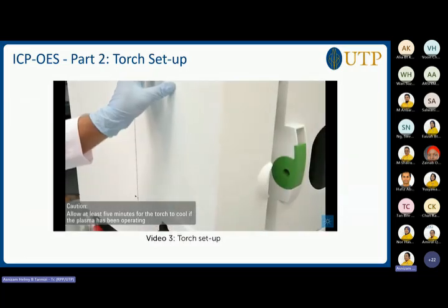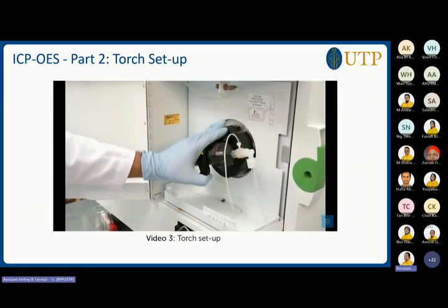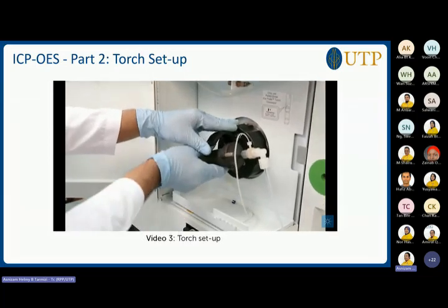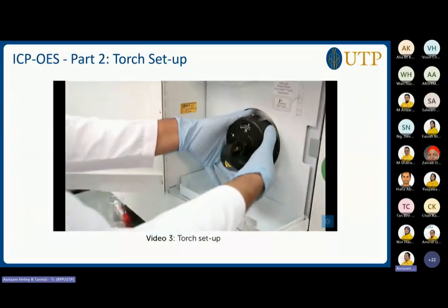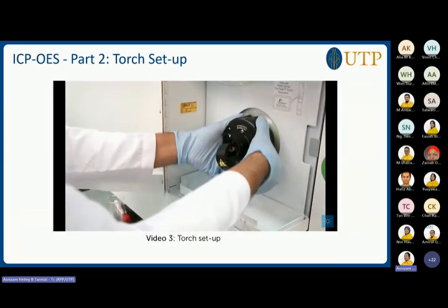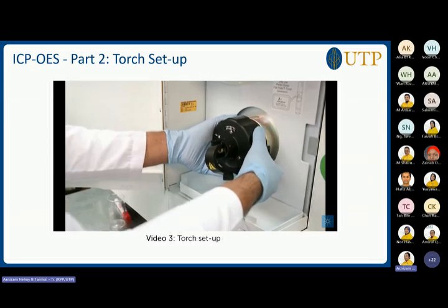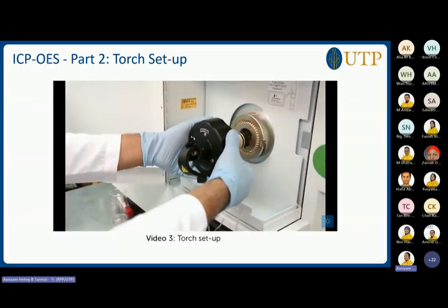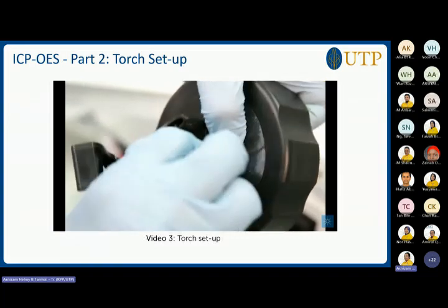Switch the plasma off and open the side door to the sample compartment. Lift the spray chamber clamp and remove the spray chamber from the mounting block. Rotate the torch module anti-clockwise. Using the channels as a guide, carefully slide the torch module out of the plasma induction plates. Press the injector lock on the torch coupler and remove the injector.